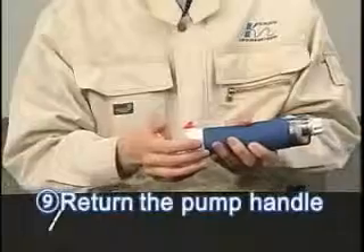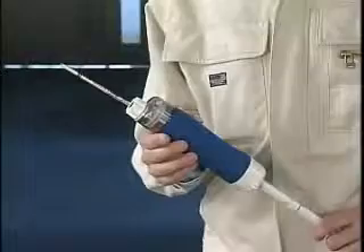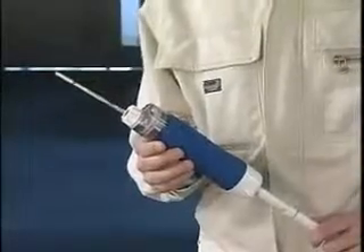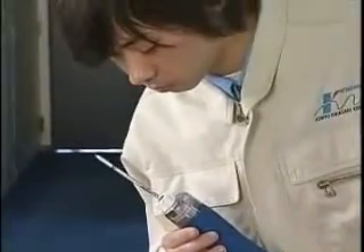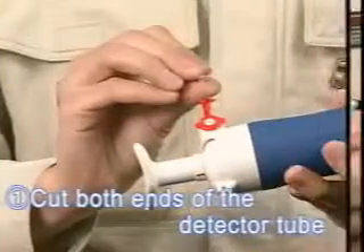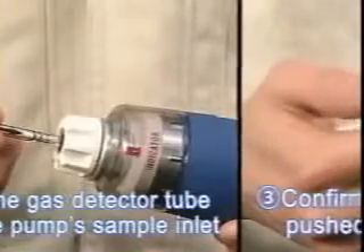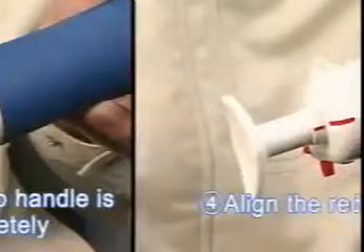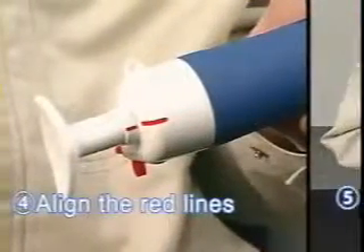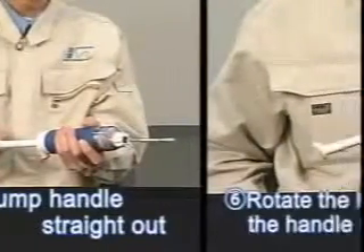Push the pump handle back into the pump so it is ready for your next measurement. This detector tube is so sensitive that it can detect carbon dioxide from your breath. That's all there is to using the Kitagawa gas detector tube system. As you can see, it is easily operated with a minimum of training. With the Kitagawa gas detector tube system, an accurate measurement of gas concentration is possible without the need for expensive instruments or equipment.